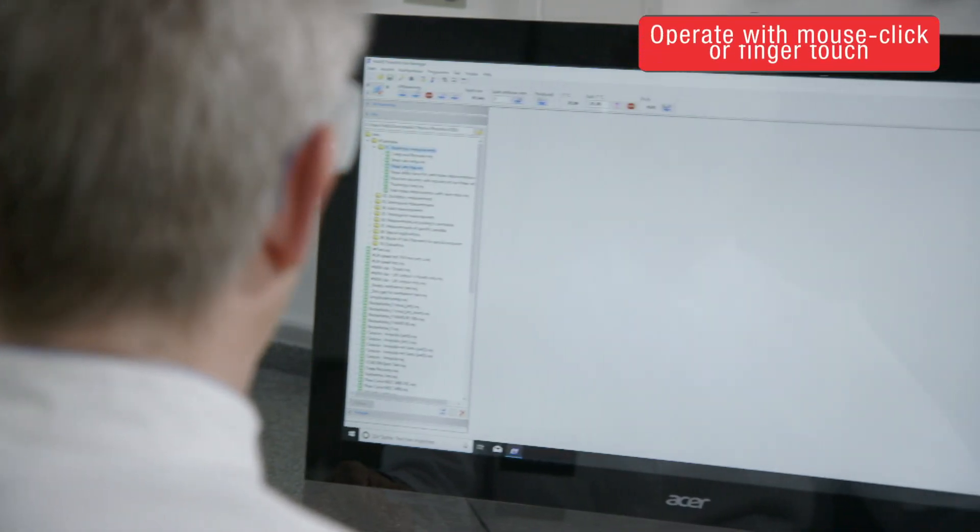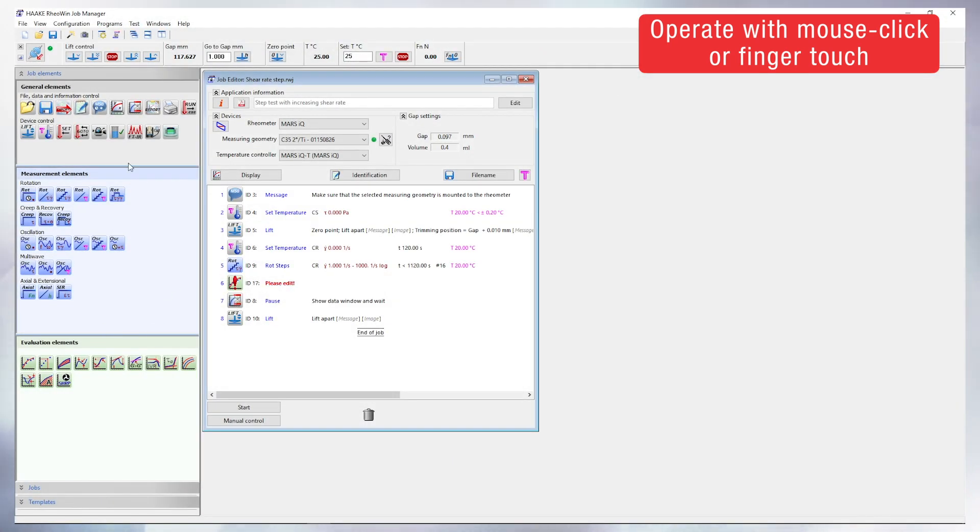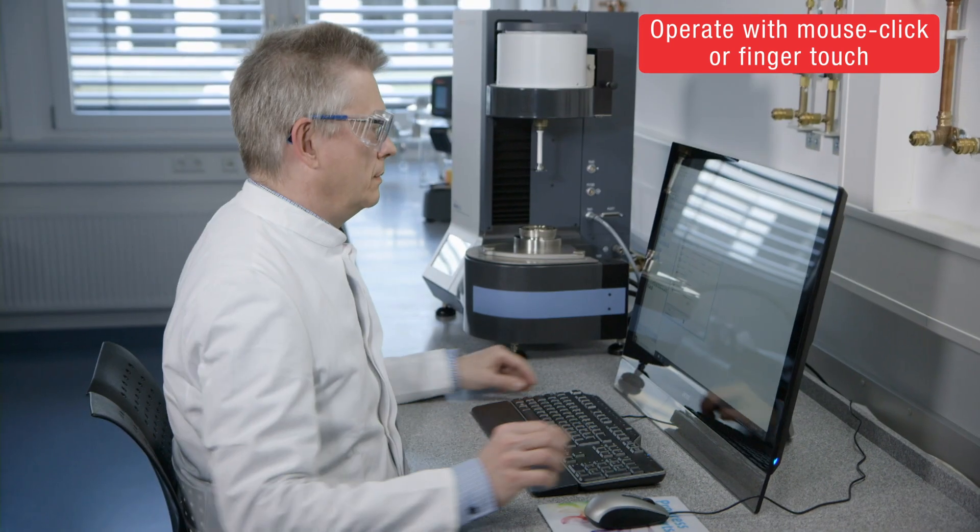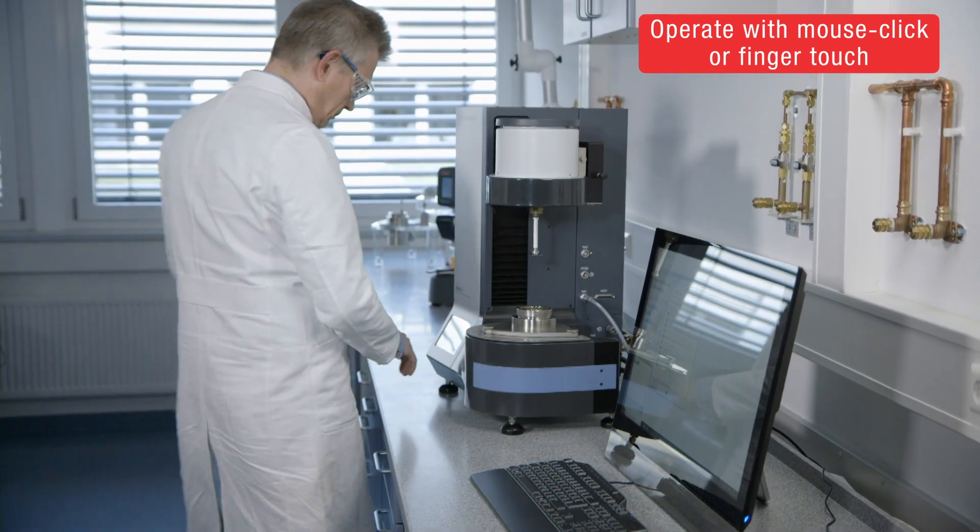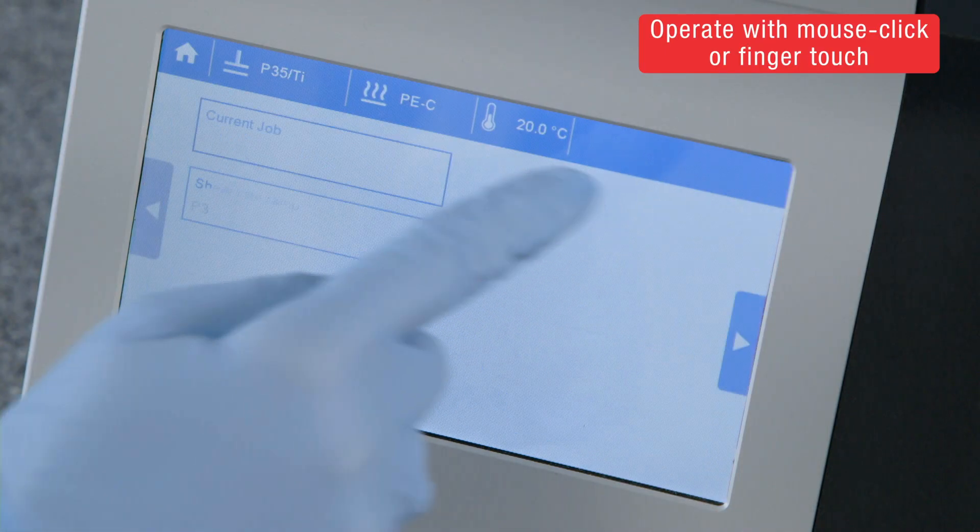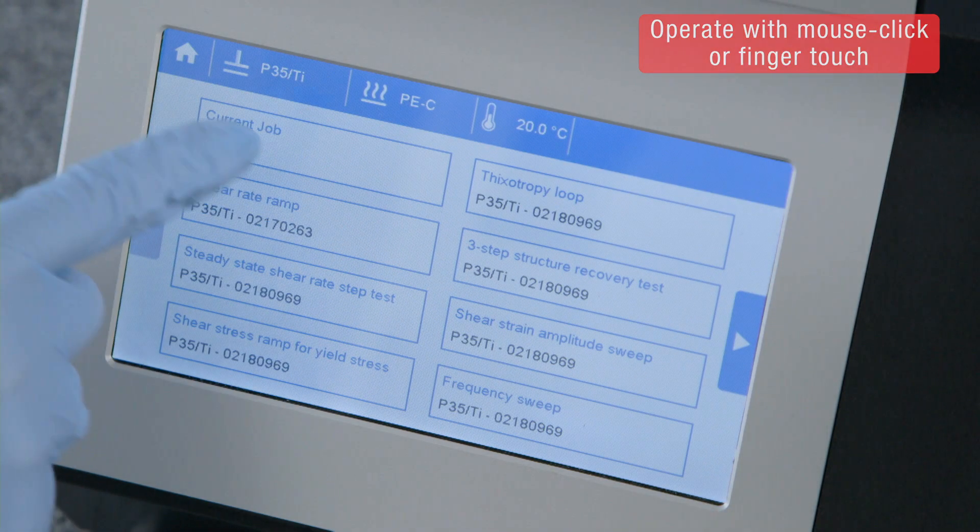Operate the rheometer with a mouse click or finger touch. Create your own job by using predefined measuring and evaluation elements in the software. All software methods can be launched directly from the instrument touch screen.